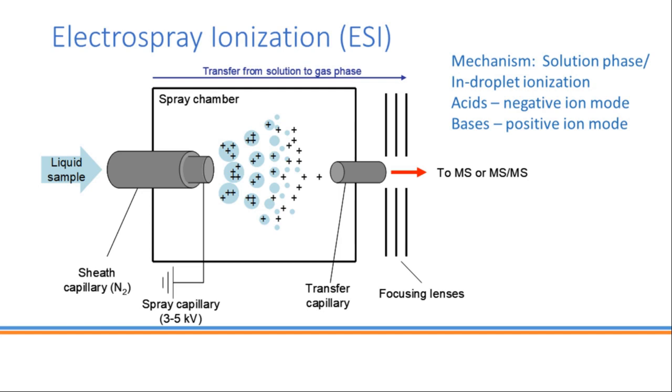When we apply a positive potential, we essentially suck out some of the negative ions in the solution, creating enriched droplets of positive charge. And those positive charges want to get away from each other. And so when they see the exit of that capillary, they will spit out into this cone jet, what's called a Taylor cone, that will ultimately release these gas phase ions.